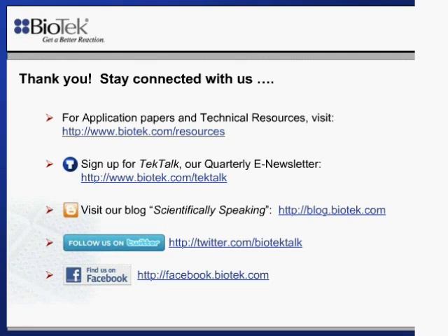The next question, the growth curve data on the last slide: is this live kinetic settings data on the BioTek plate reader, or were samples loaded externally on the microspots? These were samples that were taken out of the culture at time points and then loaded on the microplate.